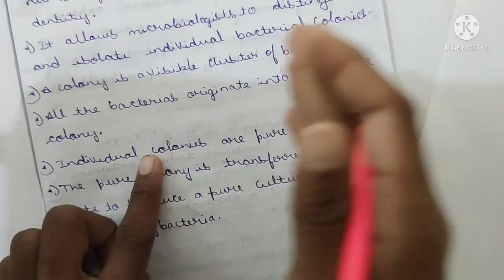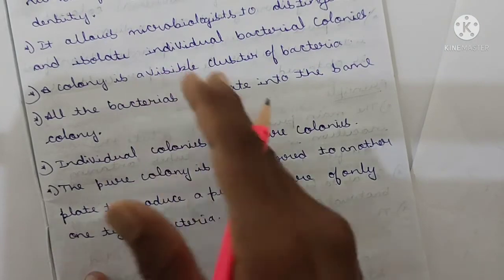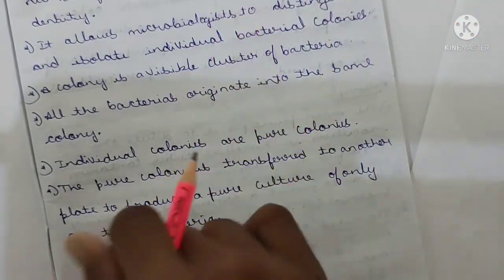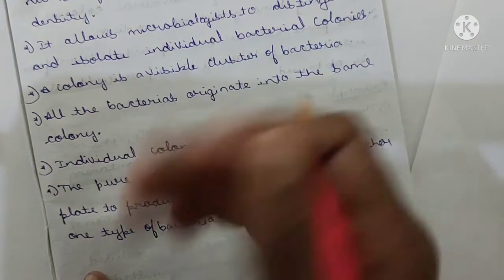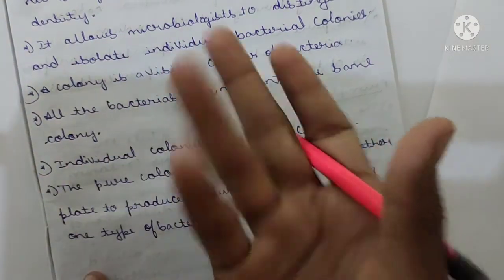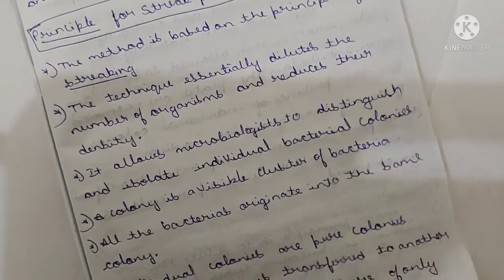That individual, separate microorganism will be transferred to different plates. In the particular plate, the particular microorganism is present. There it can be easily cultured. It's nothing but a pure culture, because only one type of bacteria is growing. Yes, this is the method of streaking to obtain the pure culture.